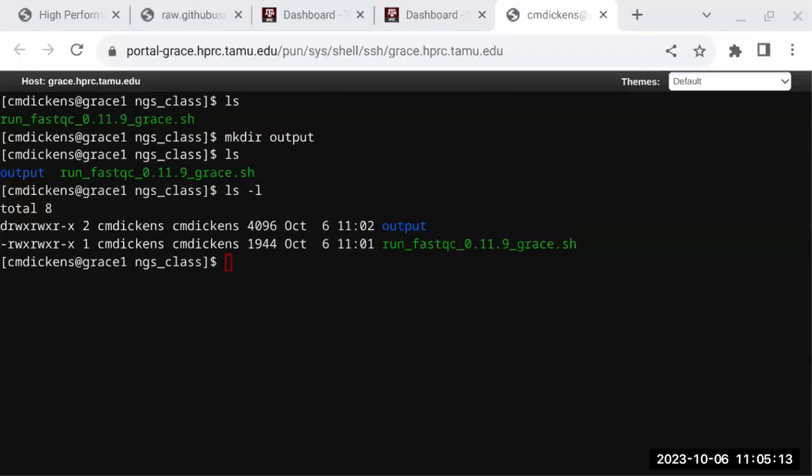This is kind of a simple job script, but why did I do this one step? Put a little comment in there. So I'm doing this because I did some research and found that this is the best way. You might even put a link to the web page. It's good to comment your job scripts, because a lot of that information, or some of it, may be asked later by your PI or when you're trying to publish, right?